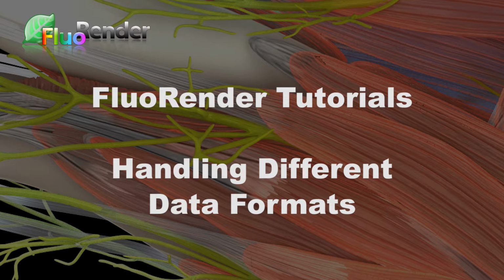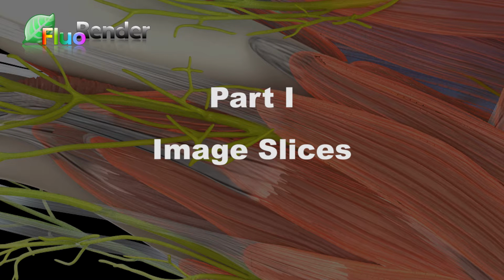FluoRender tutorials. Handling different data formats. Part 1. Image slices.